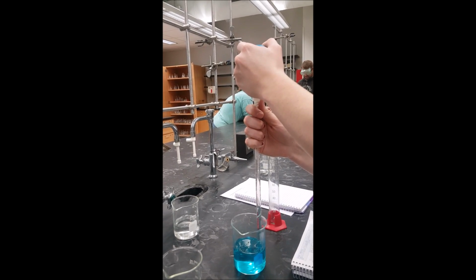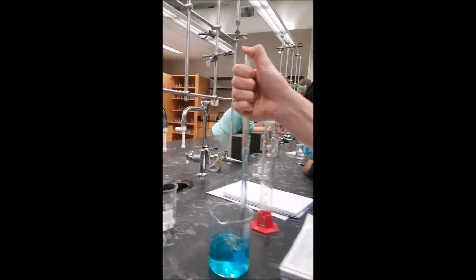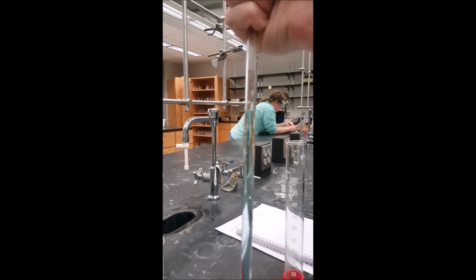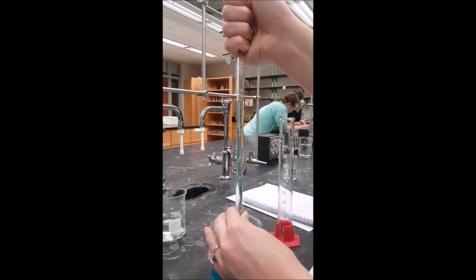When reading the meniscus on the pipette, make sure that you read from top to bottom and include your area of error, which would be 1/100th of whatever number. So if you get 1.8, it would be 1.81 or 1.79, depending on where you feel like the bubble is in the meniscus.